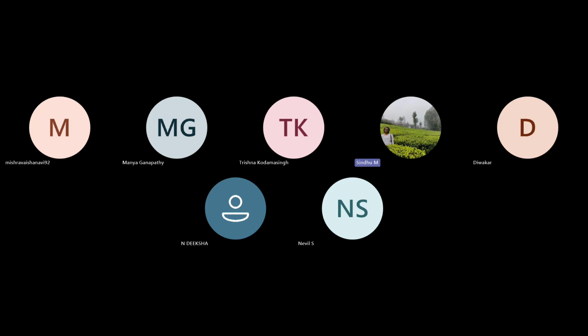So now again, if you do measure for these 4 ROIs, then again, you get, actually we have 8 values because we had the first 4 values. It's all getting appended to the same frame. So you can close it. And if you want just these 4 measurements, now you just have these 4 and you can save it as a CSV file later if you want to analyze it.